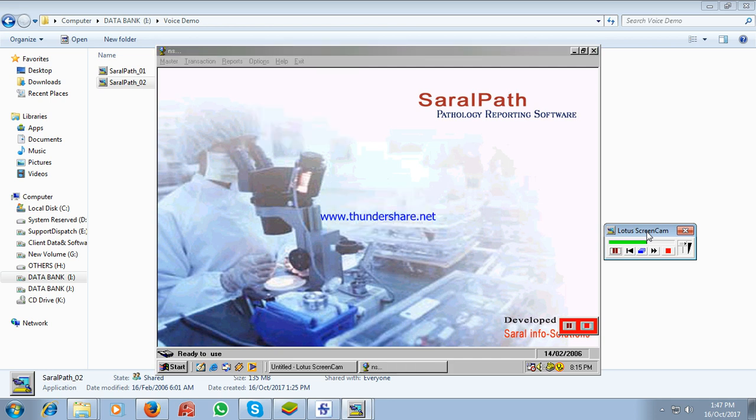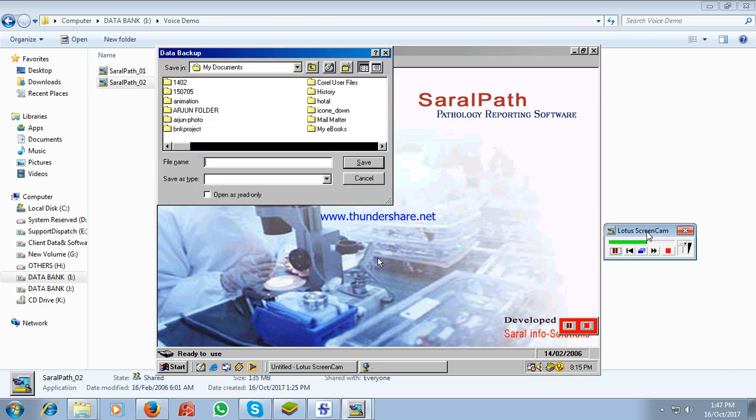Backup. If we wish to create the backup of all the database up till now, we can go ahead and do so by clicking on this backup option. In the file name option, we'll put under which file we wish to save that database and click on save button. In this way we can have another copy of all the data which we have completed till now.